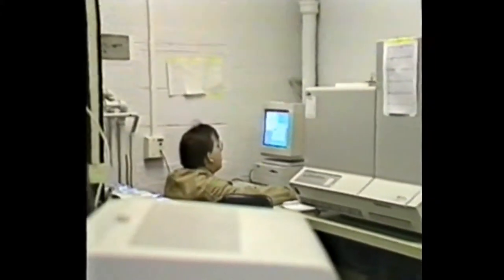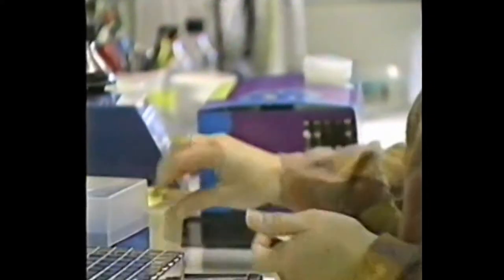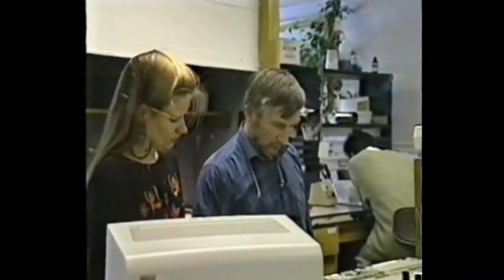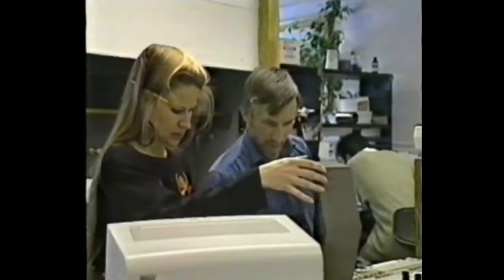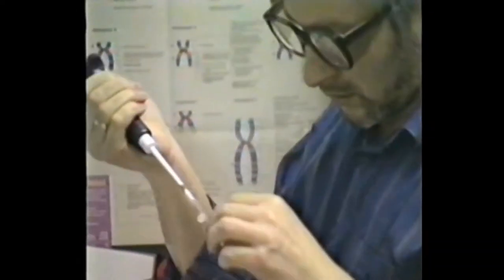Dr. Studier's work is focused on creating a completely automated system capable of sequencing long stretches of DNA in a cost-effective manner. Because of the scale of the Human Genome Project, cost-effectiveness is equally as important as speed. Studier's technique is an improvement of an already existing method known as primer walking. This method starts with a long DNA template of unknown sequence and a short DNA primer which binds to the template. In order to get a better understanding of his approach, Studier gave us a quick overview of primer walking.